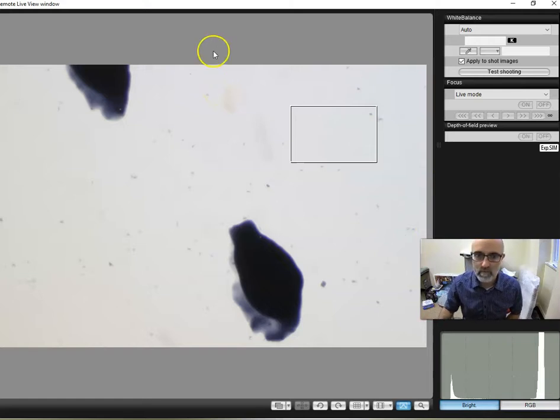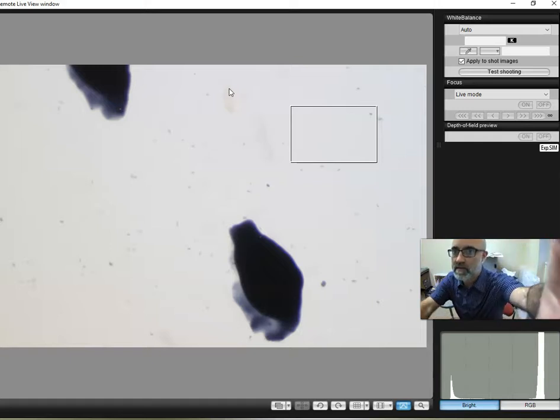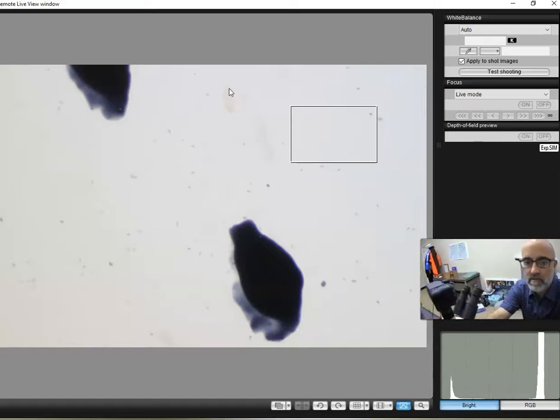Now, here's our 1, our 2, our 3 little dots that would be up here, and there is our specimen. Our handsome little tardigrade. So now I'm going to move, again, this is another function of this microscope.